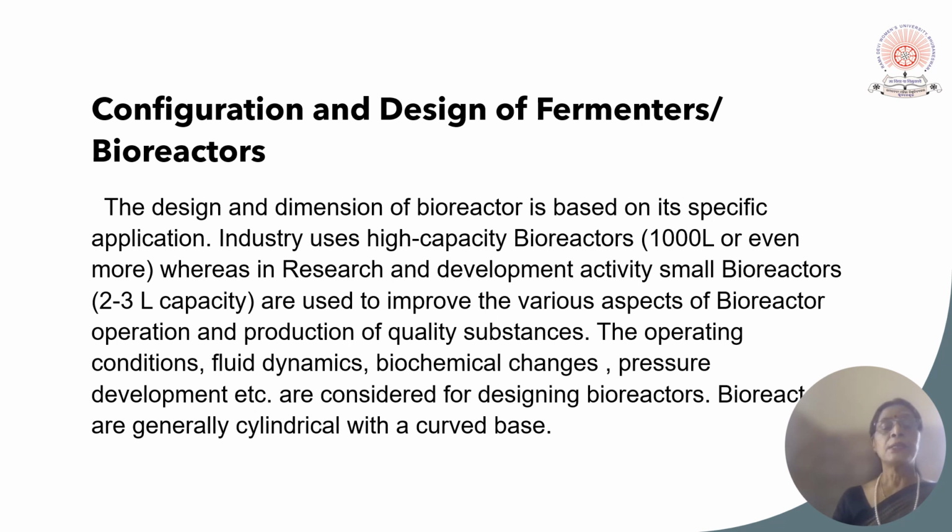Configuration and design of a fermenter or bioreactor. Many things are considered while designing a bioreactor because the product recovery, the quality of the product, and the quantity of the product depend upon the design of the fermenter.